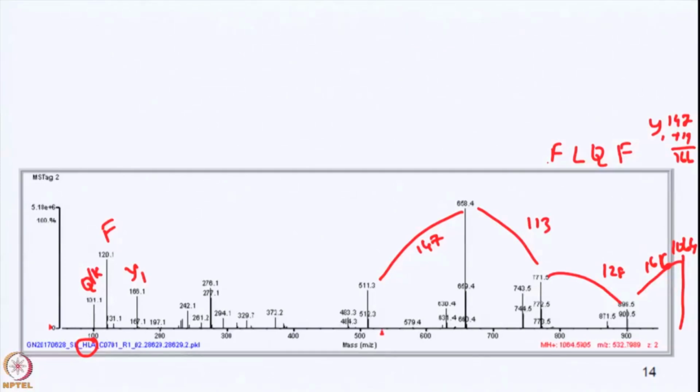And these would be, that would be Y ion? No, that would be B ions. This is 28, right? It's a B ion. 28. It's a B ion. All right, what else can we do here? That's again 28.